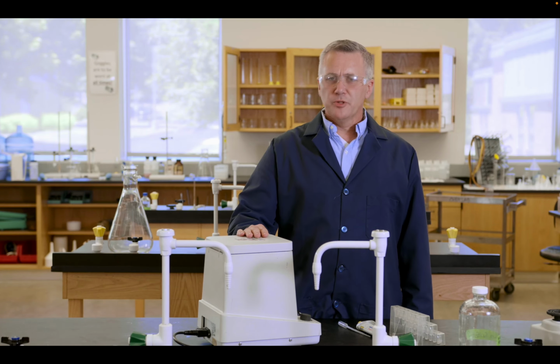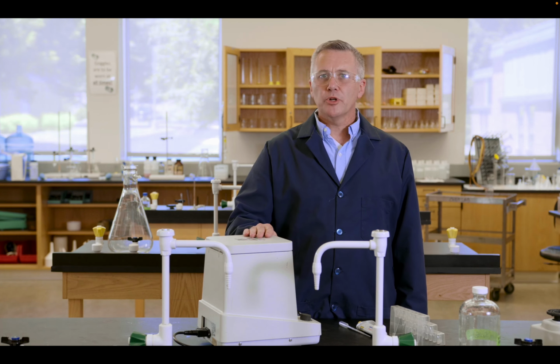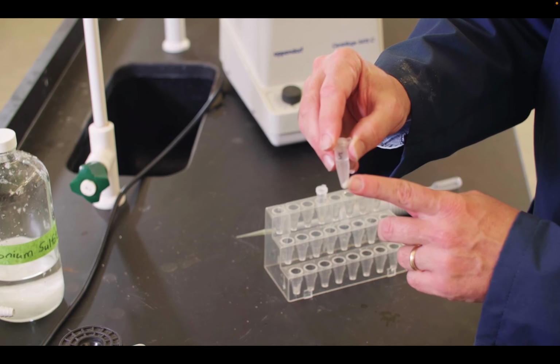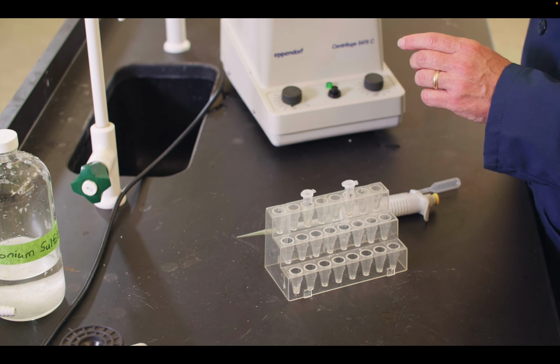All right, so as we're finishing up, the microcentrifuge is just spinning down, and we added the appropriate amount of ammonium sulfate to each one of those 7 tubes, and then we cooled them on ice for 20 minutes, and then we put them in our microcentrifuge to spin. And what you can notice is that if you look at each one of these, there's actually what we call a protein pellet at the bottom, and that is the amount of protein that has precipitated or pelleted out from each sample, given the amount of ammonium sulfate that we put in each one. So we'll pull these out.